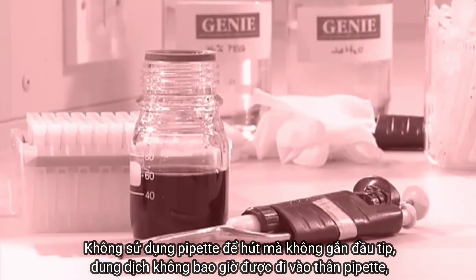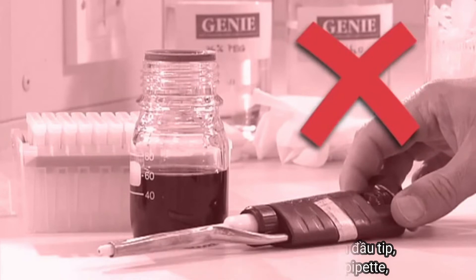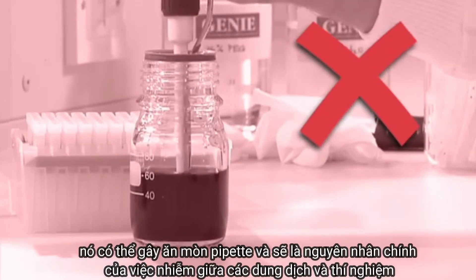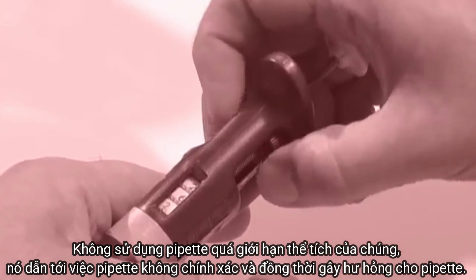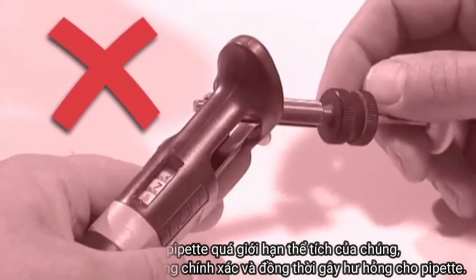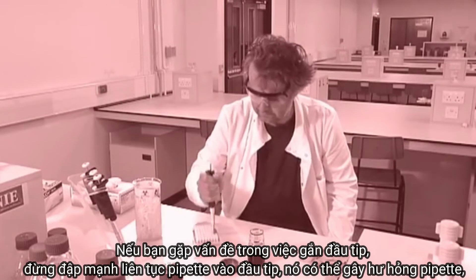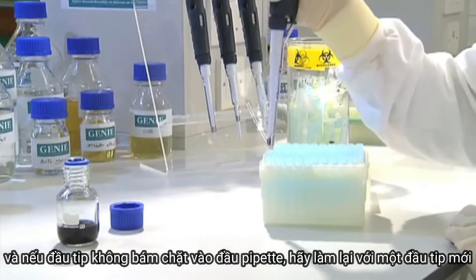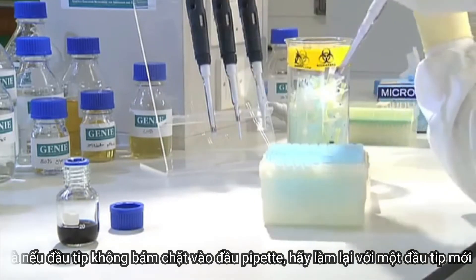Do not use a pipette without a tip attached, as liquid should never enter the body of the pipette — it will cause the pipette to corrode and will be a major source of contamination between liquids and experiments. Do not use a pipette past its volume limits, as this causes pipetting inaccuracies and damages the pipette. If you're having trouble attaching a tip, don't repeatedly jam the pipette into a tip as this can damage it. If the tip doesn't stay on, simply repeat the procedure with a new tip.